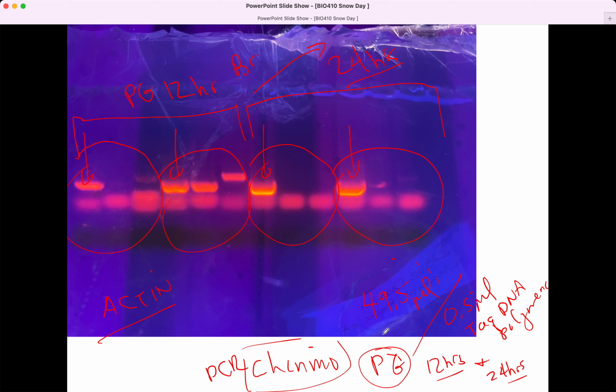So at the start, we should have 49.5 microliters, and I could set a pipetter at 49.5 microliters and pick up each of these volumes with a different tip each time, because I don't want to cross-contaminate our samples, and just double check the volume.